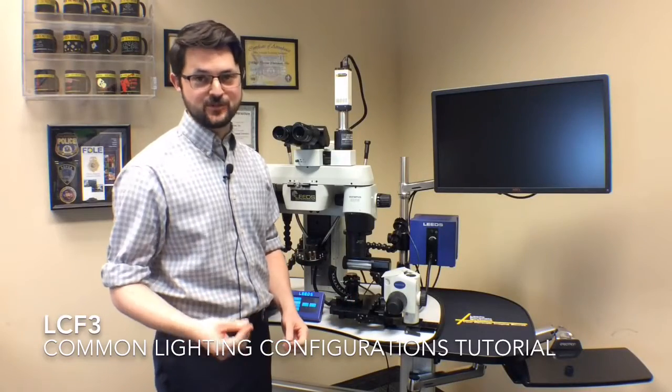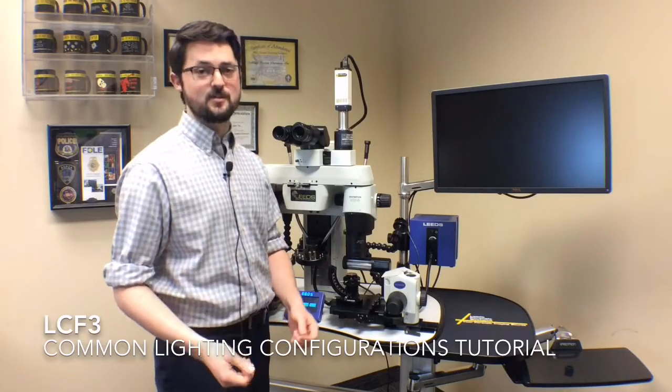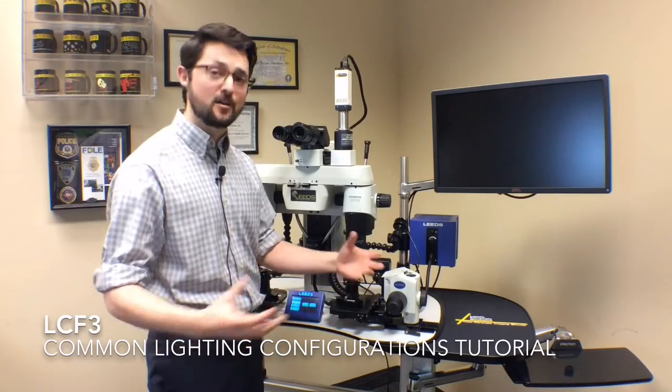Hello, my name is Jake Kurth. I work with Leeds Forensic Systems. Today we're going to be going over our most popular lighting options on the LCF3 firearm comparison microscope and how they all work.